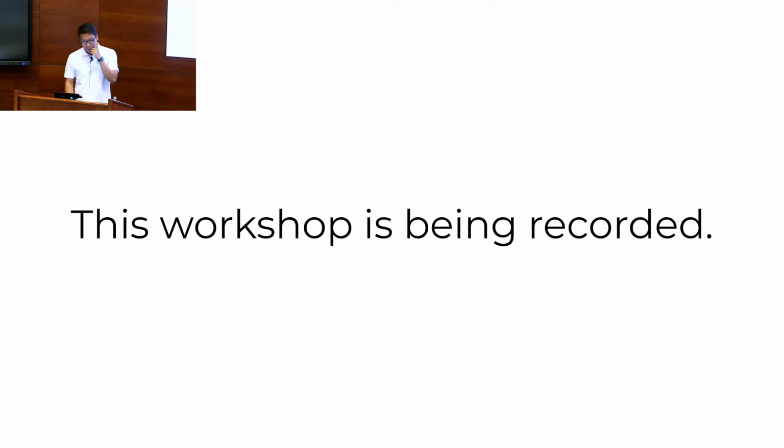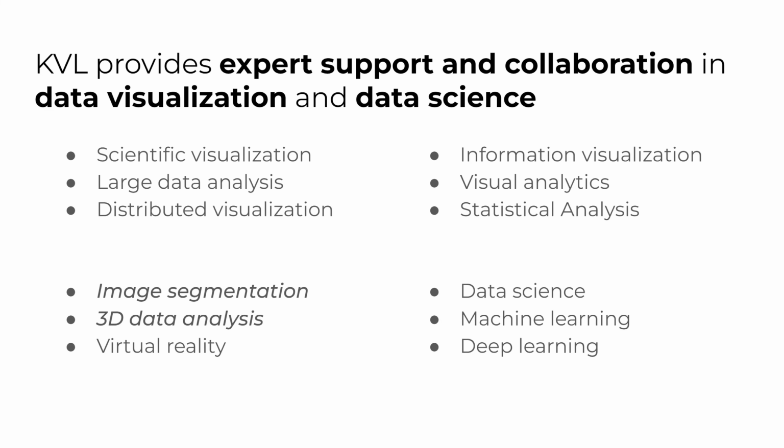So just a quick note, the workshop will be recorded and we're going to post the workshop on YouTube, but please still stay. So were you guys able to install Avizo and Ilastik? Yeah? Okay, cool. So we're going to do a bunch of hands-on stuff. And I'm also providing some PDFs and videos where you can follow for the AI tools for later.